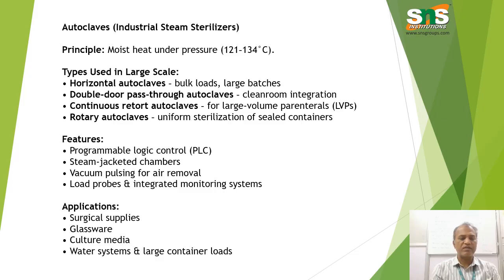What are the features? We know what PLC is, Programmable Logic Control. Nowadays almost all sterilizers used in industry have integrated PLC and SCADA programming. Next, steam jacketed chambers, and vacuum pulsing for air removal for safety purposes. Next, loading probes and integrated monitoring systems with high level sensing equipment. What are the applications? Surgical supplies, glassware, culture media, water systems and large container loads. The items discussed under applications are mostly sterilized in autoclaves.